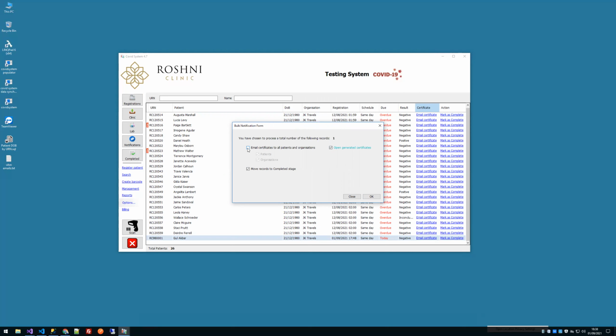Say again. So I'll go through. That's a good point, actually. So we've got templates assigned to these. There's a default template assigned to all the organizations. So what I'm doing is I'm saying send these, move to completed.